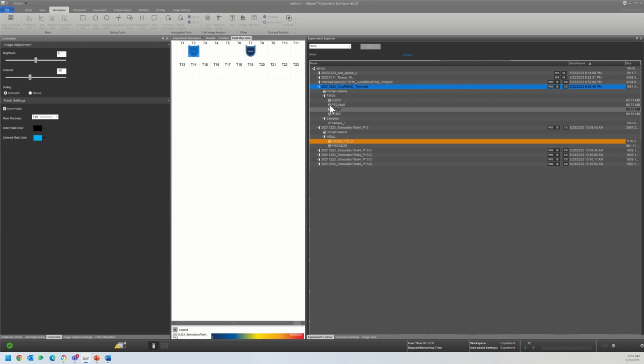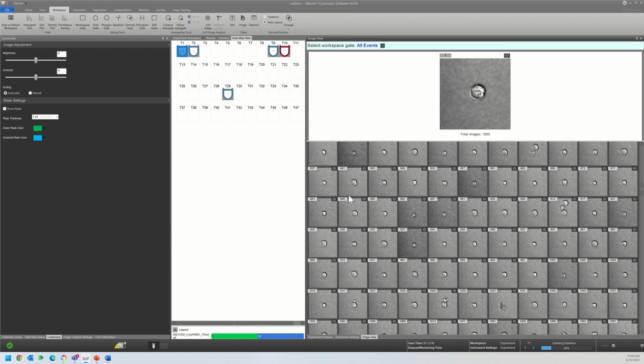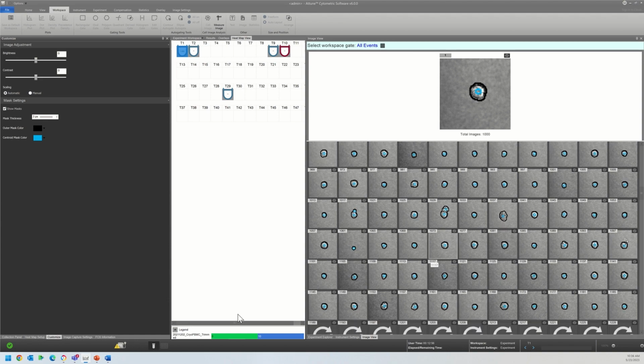And if I was going to show an example of some well annotated cells, we can come in here and we can see, I turn on these masks. This is a very classic sample with really good masks that are very closely annotated. You see that there's very little complexity in here, and the singlets and doublets appear to be accurate.